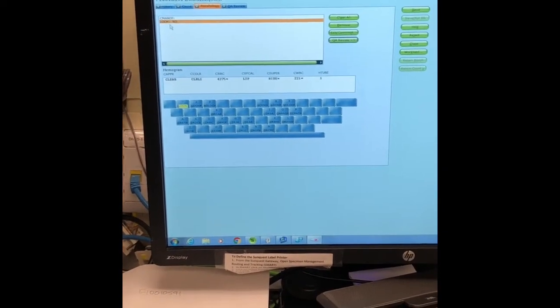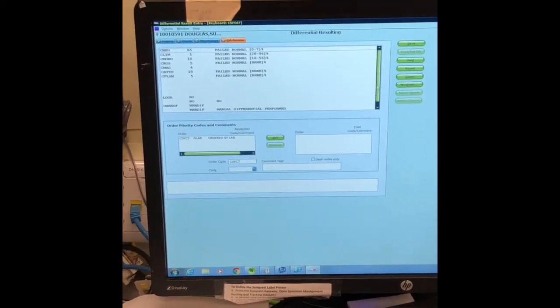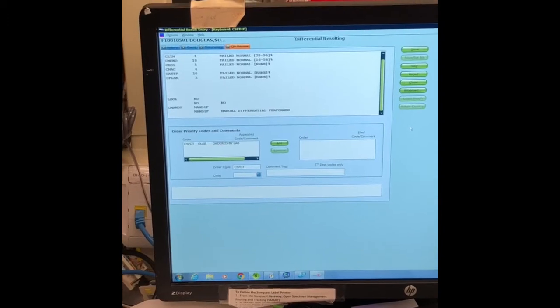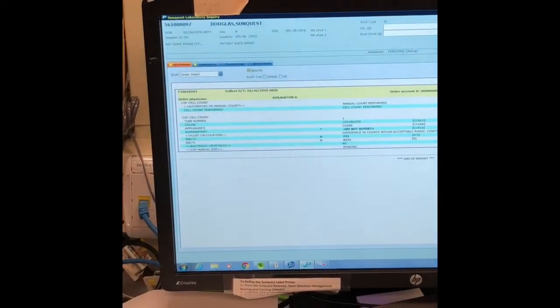Then your look is here already. QA review. Again, review it and save. And again, make sure that it goes fine.